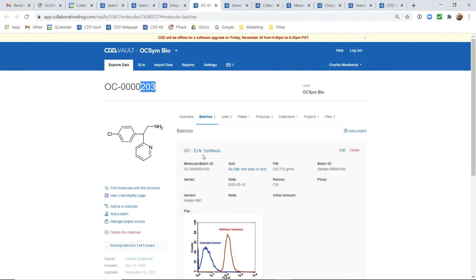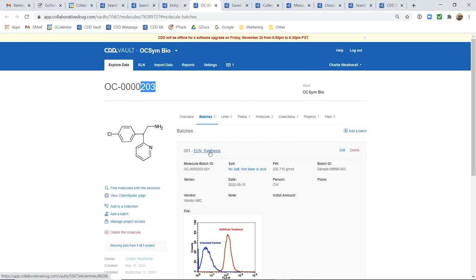So again, however you discover this molecule, however you come across and start investigating this molecule, there's always these links or these hints that there's more information in other parts of the platform. Very easy, very obvious, very intuitive that you can click through and see additional data.